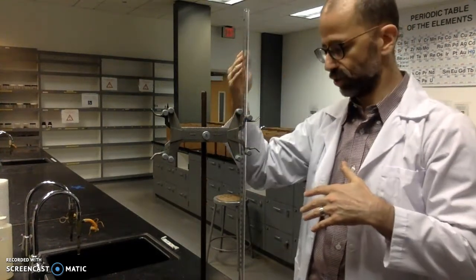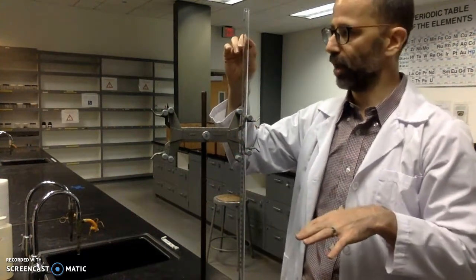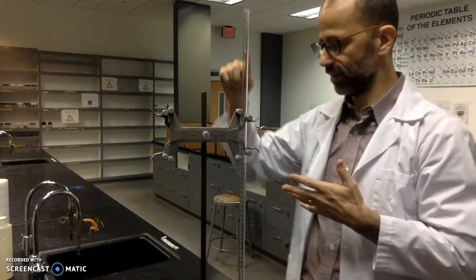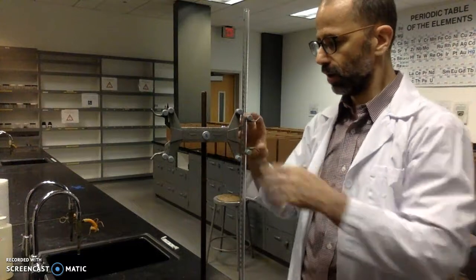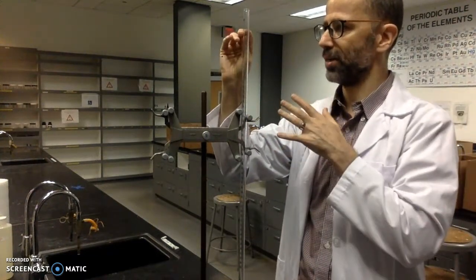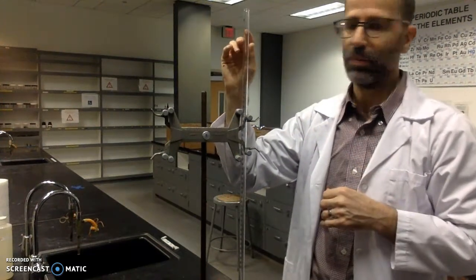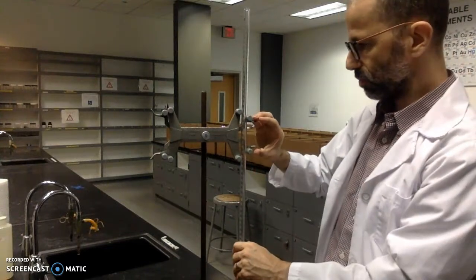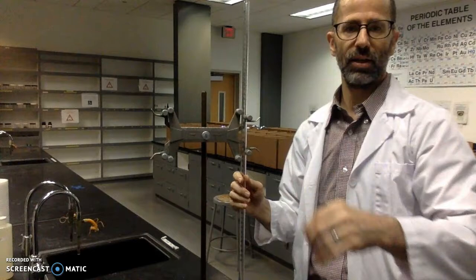And then you're going to dispense 25 milliliters. So you calculate, okay, if I'm starting here, you add 25 milliliters to that amount, and then that's where you're supposed to drain it to. Okay? So get in the habit of just measuring it where it is. Don't spend a whole lot of time trying to get it perfectly on 0, because it's just a waste of time. So just measure it where it's at. Okay? So the other thing is you want to make sure that you're reading it directly on.